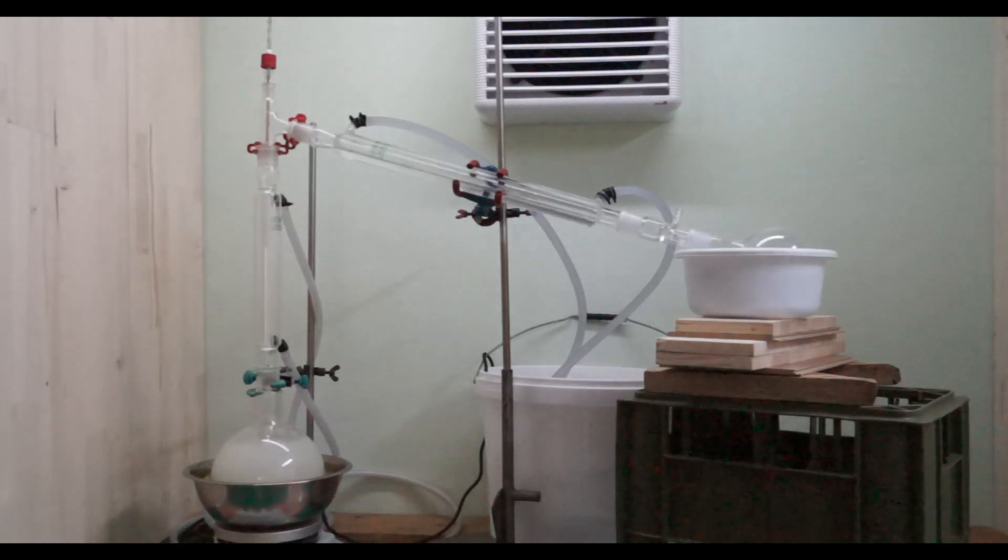When all the reagents are added I assemble the distillation apparatus that I will be using for this reaction. The 2 liter reaction flask is put in an oil bath on top of a magnetic stirrer and heater. I use a non-connected 25 cm Liebig condenser for a distillation column.